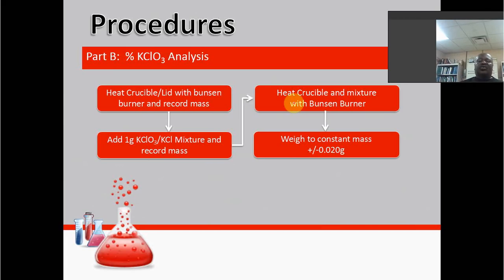And then we'll let the system cool. How do I know when it's cooled? Just watch your time. Let's give it 7 to 10 minutes after stopping the heating, and it will be sufficiently cool. Note the time in the lab, and add 10 minutes, whatever it is, and then wait.